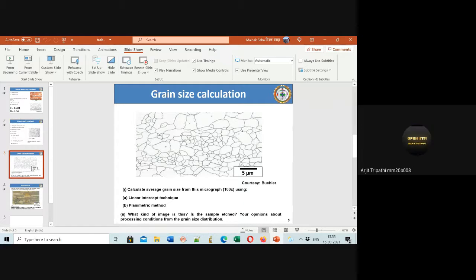So if the line is coinciding with any one of the grain boundaries, then do we have to take the intersection or not? We leave that. Yeah, we have to take one intersection only. Because it is only passing through, which means only one point of contact, not two points of contact. So whatever point of contact it passes, you have to take only that.